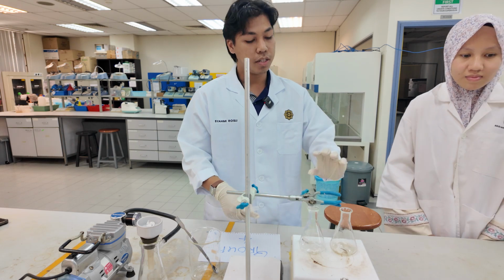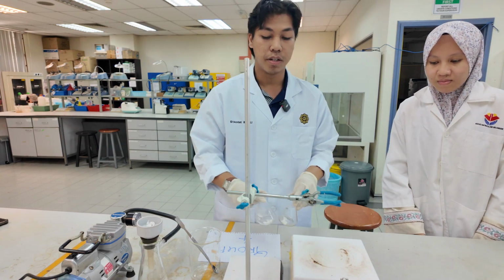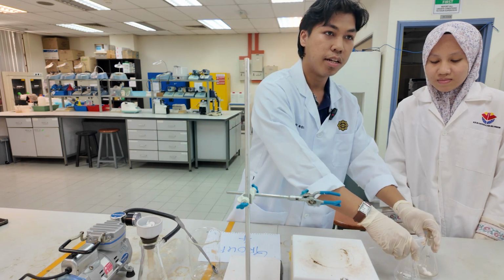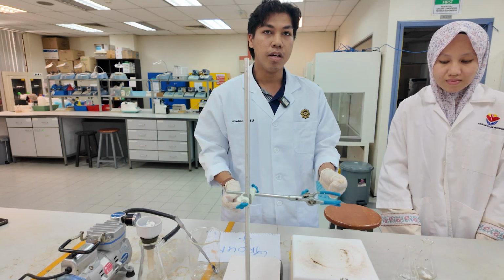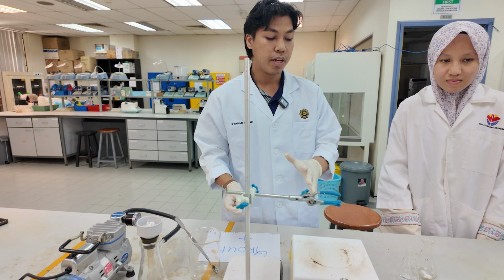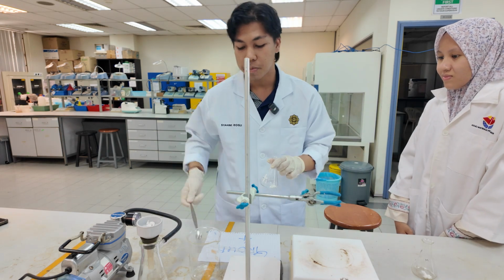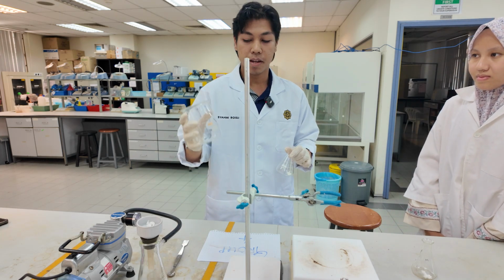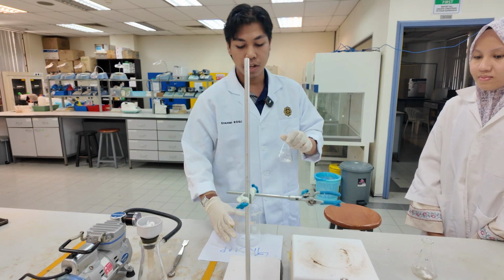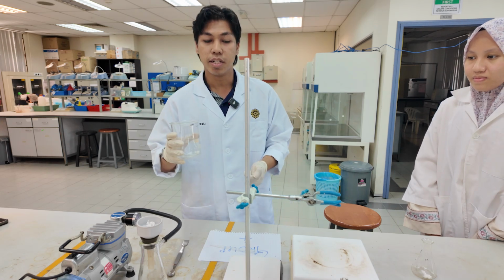After it boils, just turn off the heating plate and take it off the heating plate, put it aside, and let it cool at room temperature first. Then for the mixture flask, just imagine in this beaker we have an ice bath, and we make a room and put it inside and let it cool there.